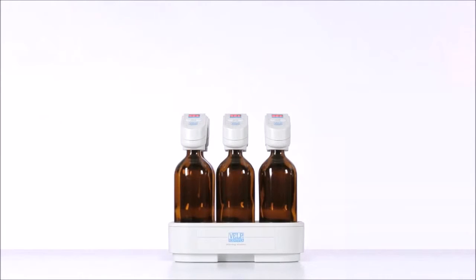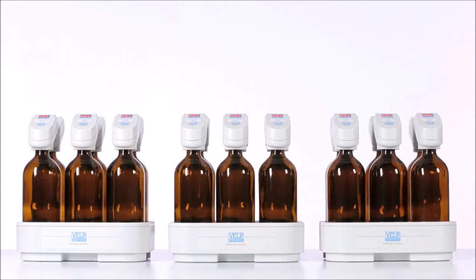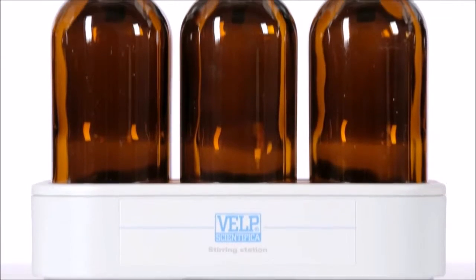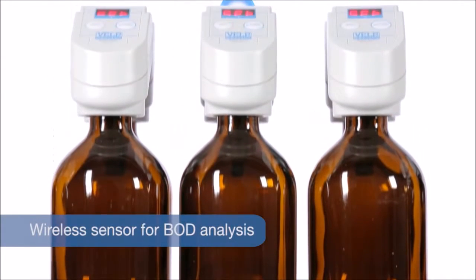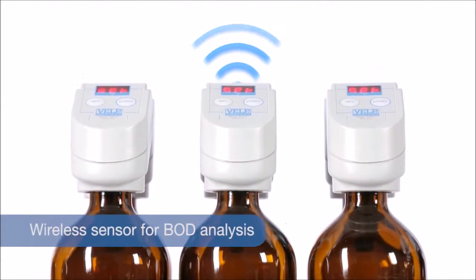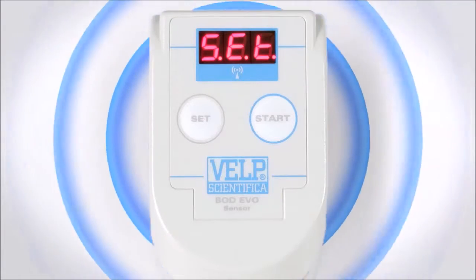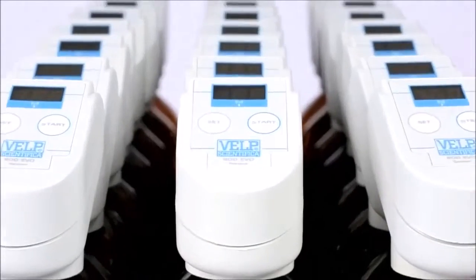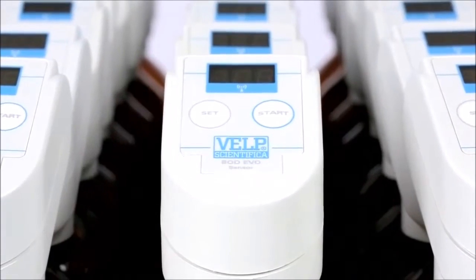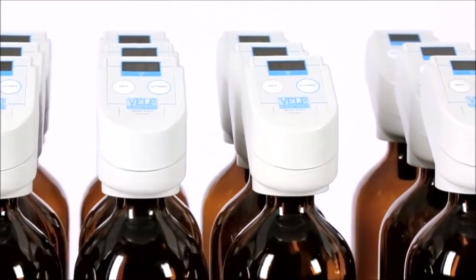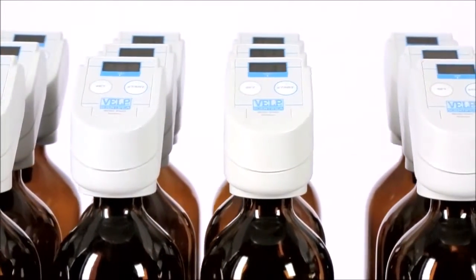The BOD Evo Sensor from VELP Scientifica is the unique and revolutionary wireless sensor for biochemical oxygen demand. BOD is a test used worldwide in which standardized laboratory procedures are used to determine the organic substance degradation by microorganisms in wastewaters, effluents and polluted waters.